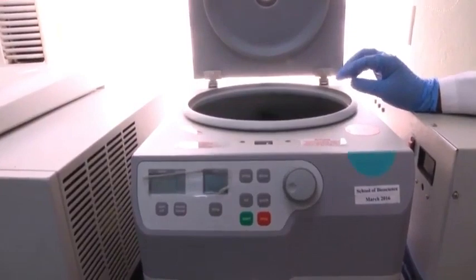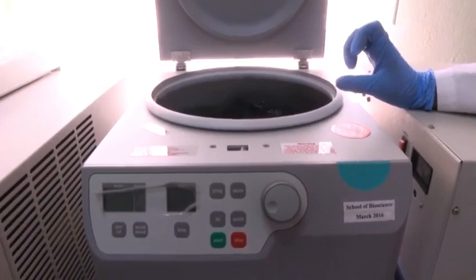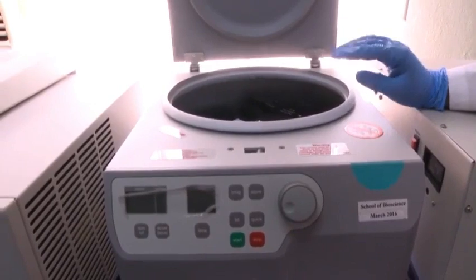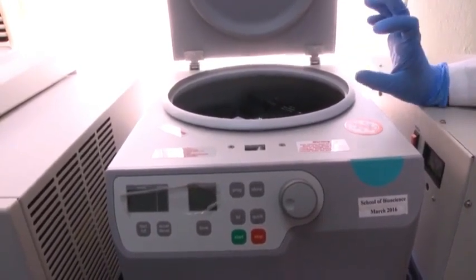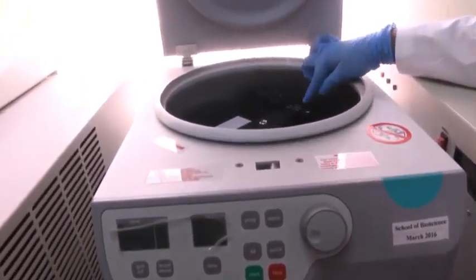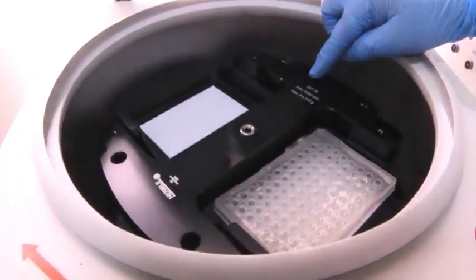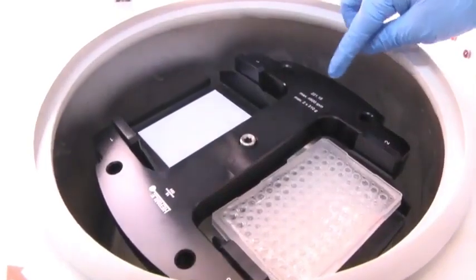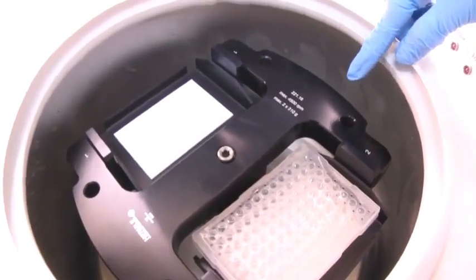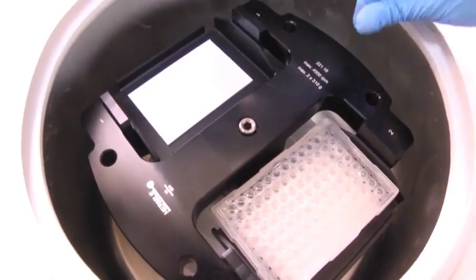This centrifuge here has a different type of rotor. Till now what you have seen is centrifuge rotors which can accommodate 1.5 ml centrifuge tubes. There are rotors which can accommodate 15 ml falcon tubes or 50 ml conical falcon tubes, but this rotor that I will be showing you here is a bit different because it can actually accommodate 96 well plates. For many types of experimental purposes, you might need to centrifuge samples kept inside 96 well plates, and for that purpose this sort of centrifuge rotor is necessary.